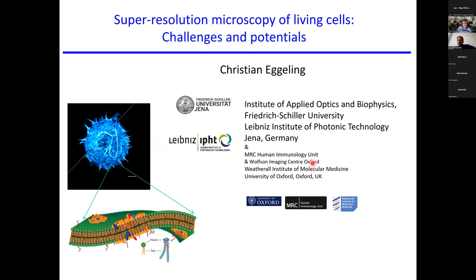back mainly also for private reasons, but also Jena is a famous optics city. Zeiss is here, and that's where Abbe was working and so on. And that's why I enjoy it really much. There are a lot of biological applications where we can test all of this stuff. And I'd like to tell you a little bit about the challenges and the potentials that we face here, but especially I want to give you a little bit of insight into mainly STED microscopy, and later on at the end, complementary techniques, closing up my talk with MINFLUX microscopy.